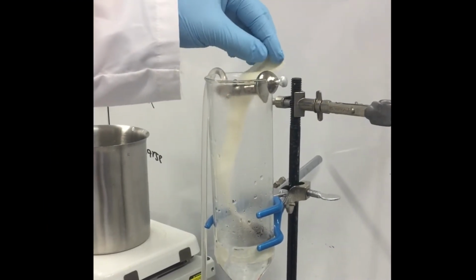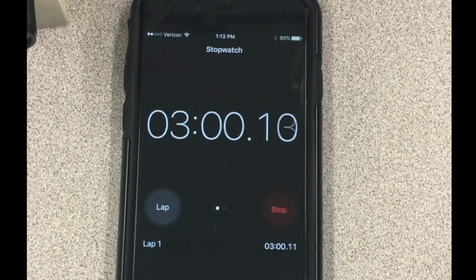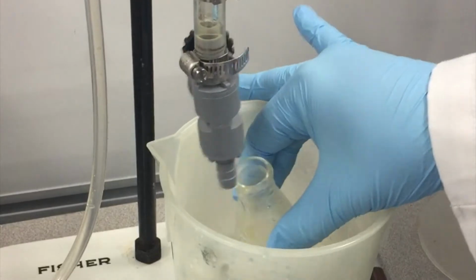After the volume is seen to stay constant, the tea bag is placed into the warm water and a timer begins. After 3 minutes have passed, 3 samples are collected in 15 milliliter increments. The tea bag is then removed and the setup is restored and ready for the next trial.